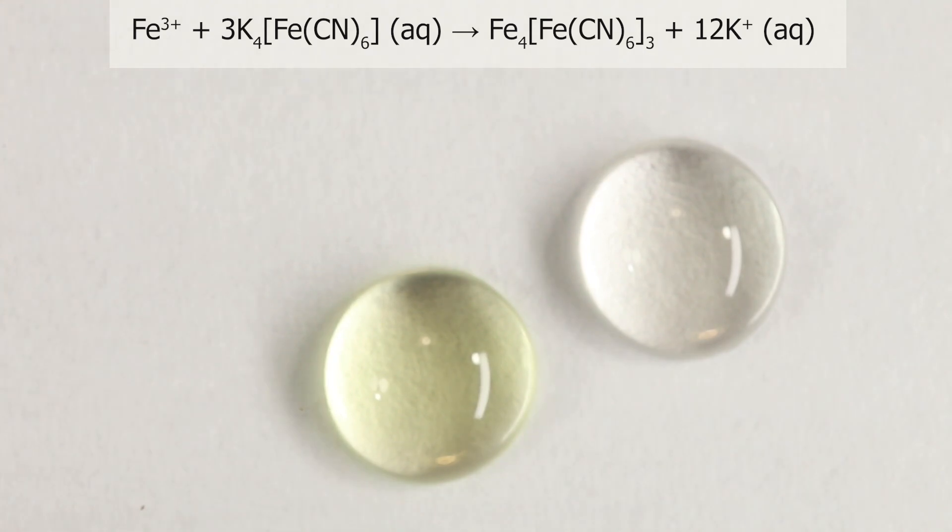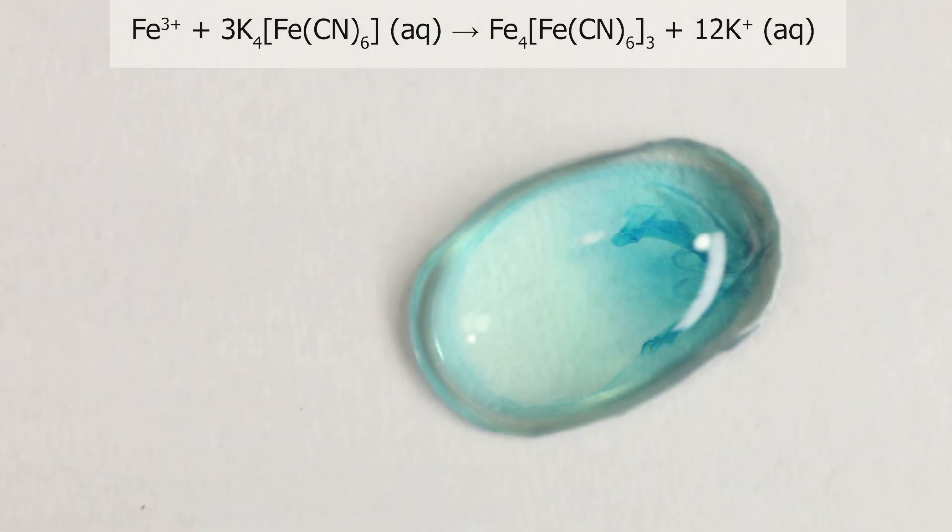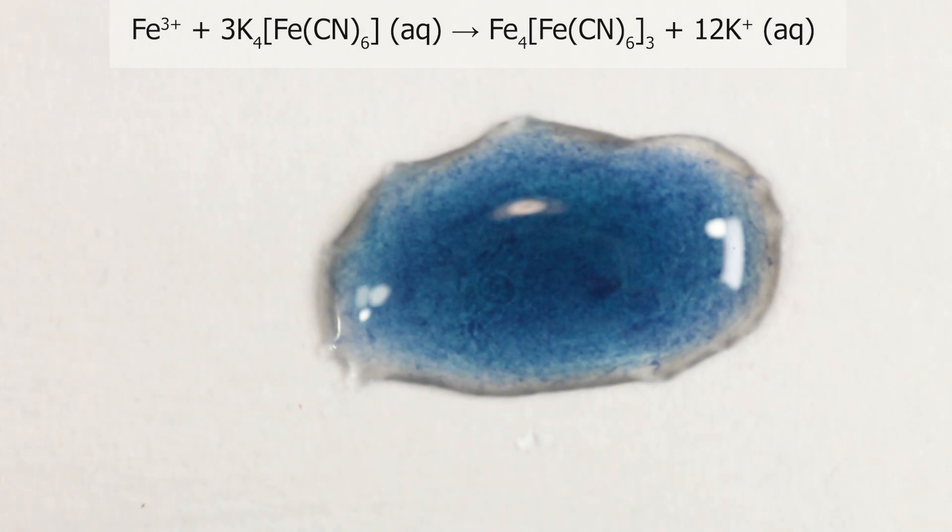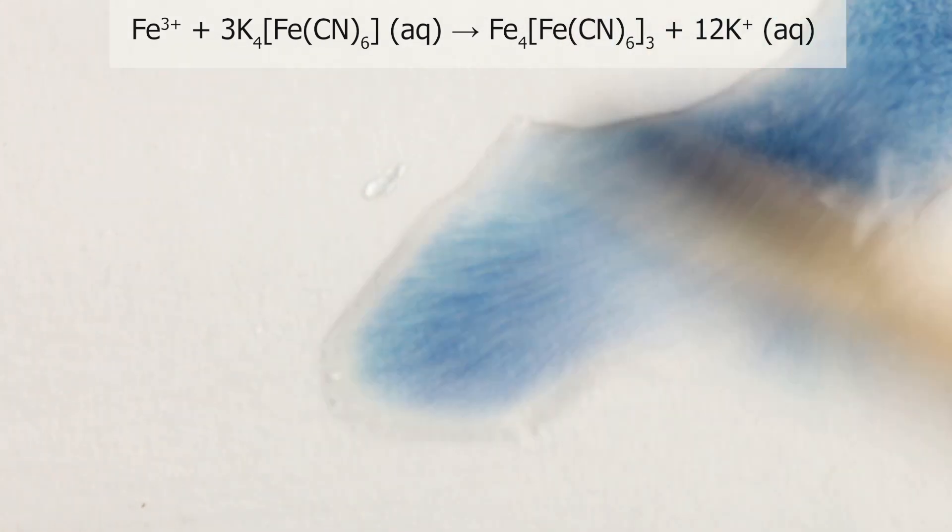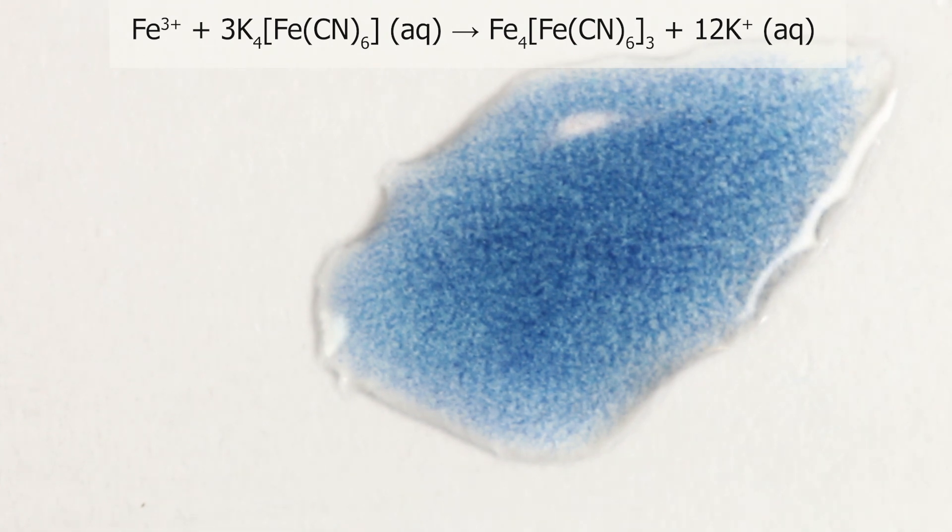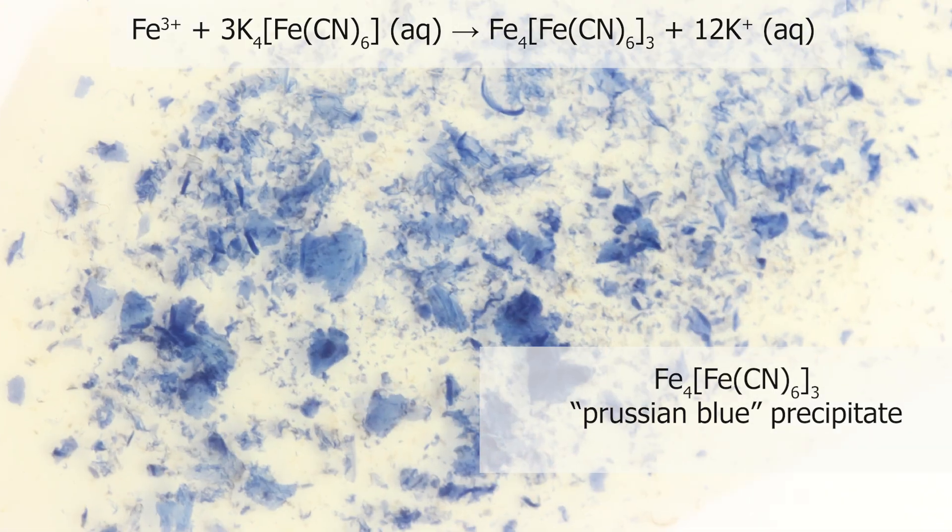Same thing on micro scale. It's not yet mixed. I have to help it. And you can see the small pieces of prussian blue precipitate. That's an enlarged picture.